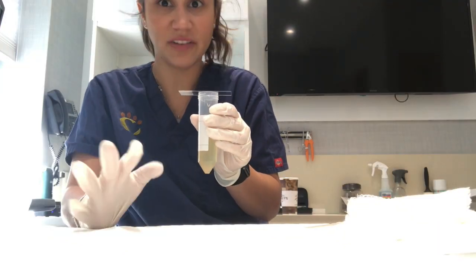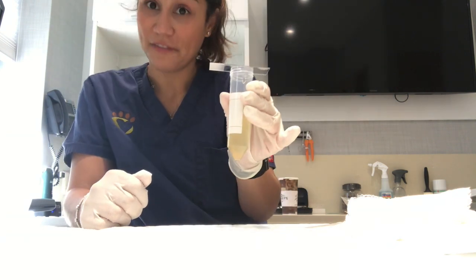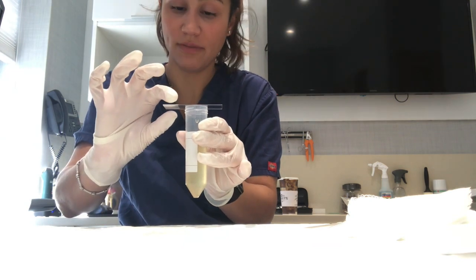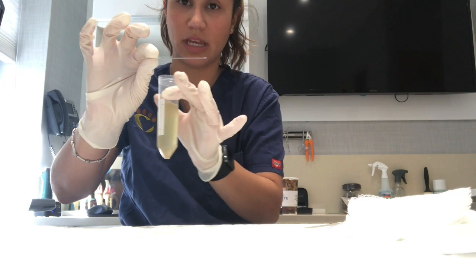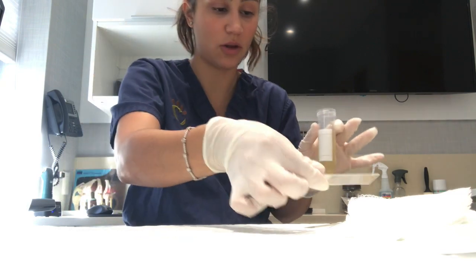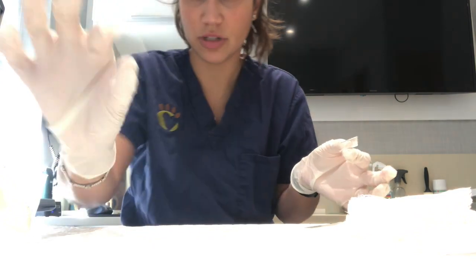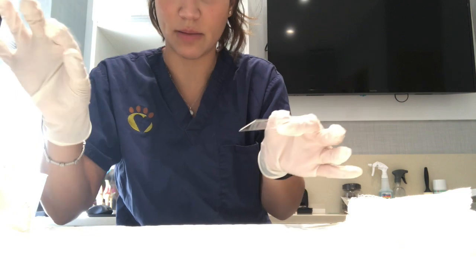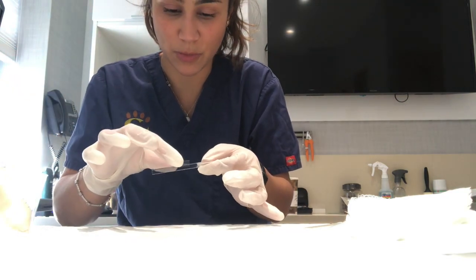It has been about 15 to 20 minutes since I let my fecal float just sit. So now I'm going to take off our slide, just straight up. And just remember that everything that is very important, any ova, is on this side. Now my cover slip was just a little too small, as you can see, to put on this big centrifuge tube. So I'm just going to take this cover slip and put it on top of my sample, and then I'm ready to look under the microscope.